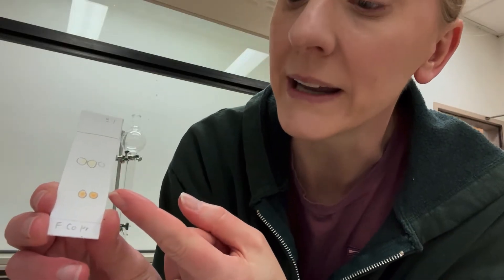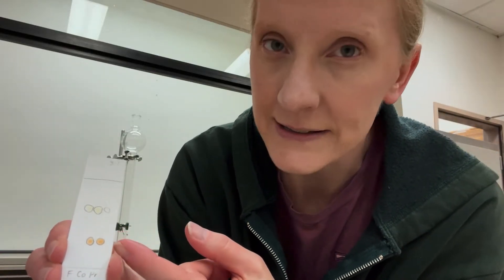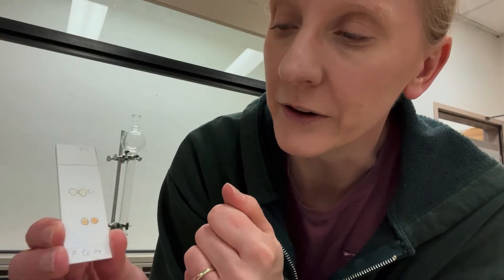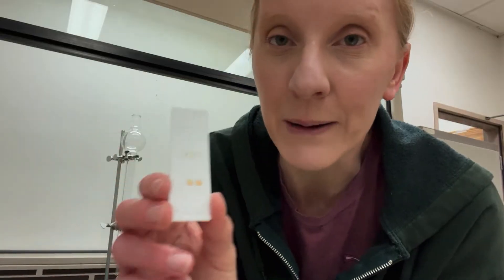You want to choose your solvent system so that the molecule that you care about, which in my case is the acetyl ferrocene, has an RF of about 0.3 and that it's quite separated from other contaminants. So I'm going to use a 3 to 1 hexane to ethyl acetate mixture for my column.